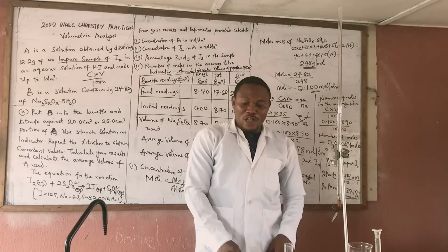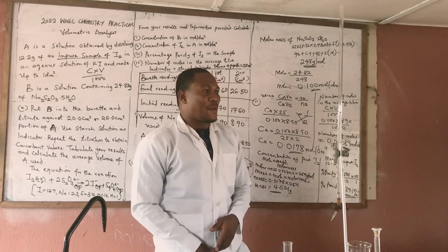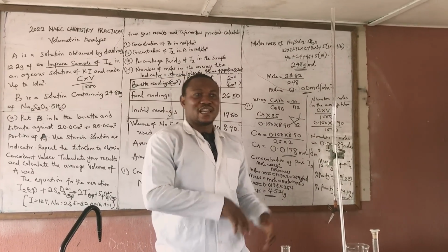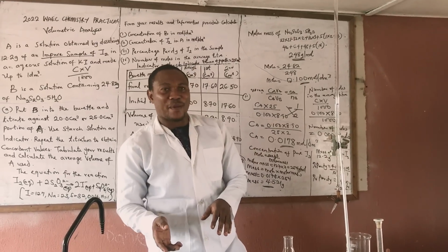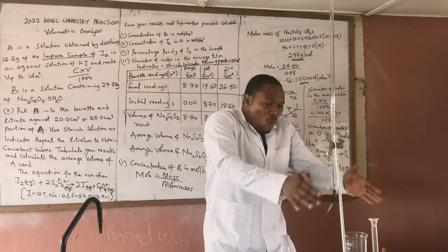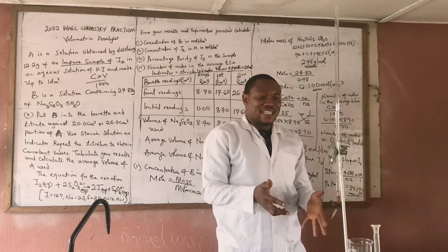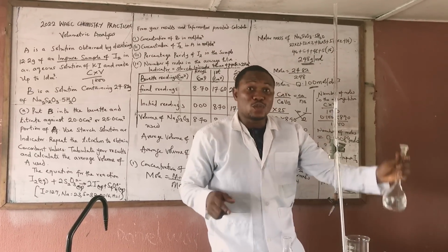Now, let me quickly round up with this. For some people that have been calling me, sir, can you have iodine in the burette? Can you have sodium thiosulfate in the pipette? This is it. What they gave us for Waec. Waec gave us a specification to prepare, which is this. Now, I want to reverse it now for you to see it yourself.